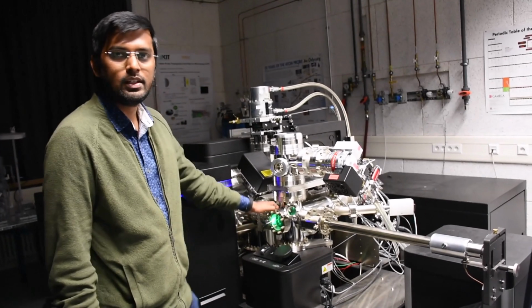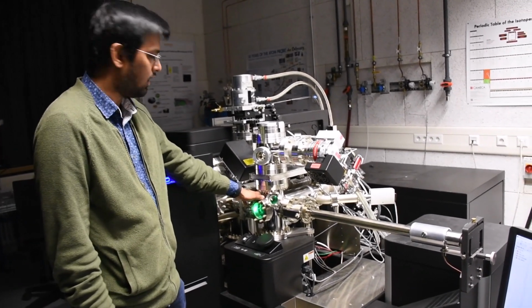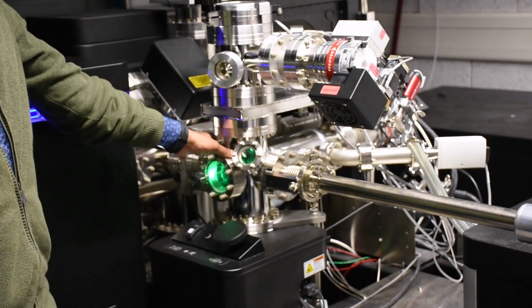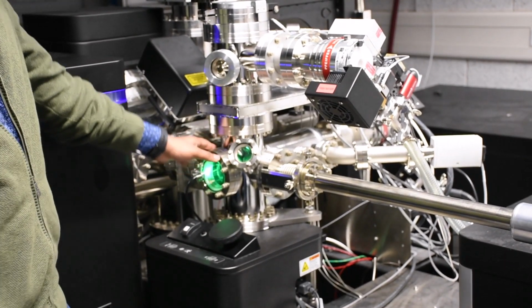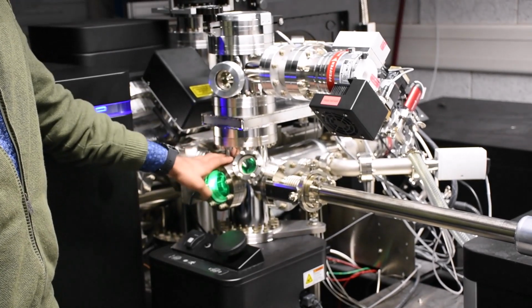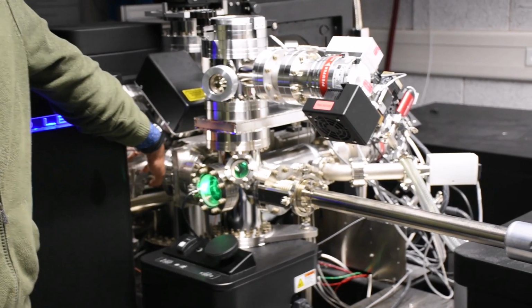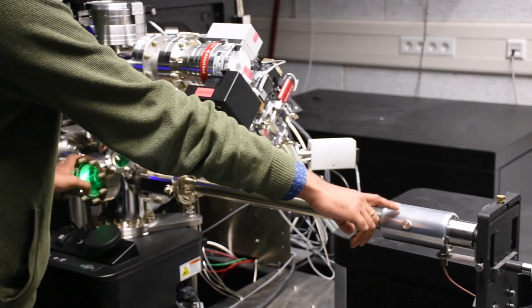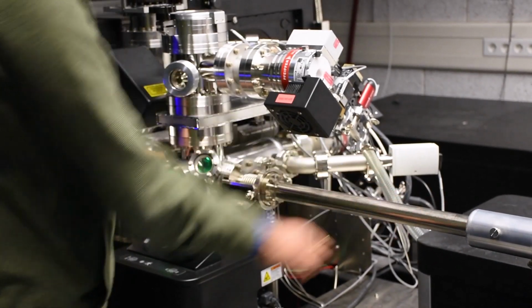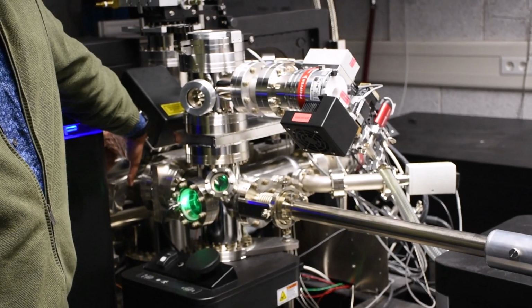Now that our sample is inside our buffer carousel and in the buffer chamber, and we waited for the pressure to get good so that we can open the valve between the buffer chamber and the analysis chamber. Now to move the sample from the buffer chamber to the analysis chamber, we use the horizontal manipulation rod, and we lock in our sample and move it to the analysis chamber.